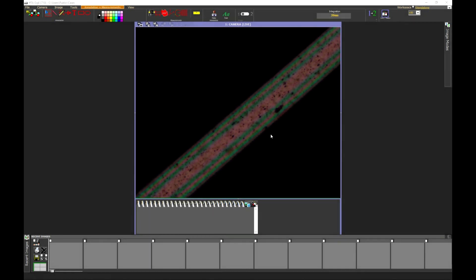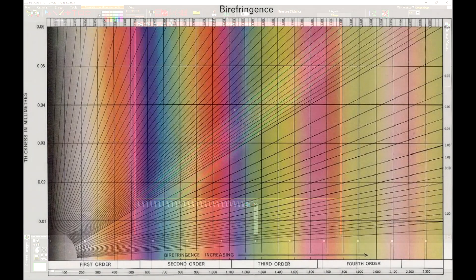We can now begin to identify the type of fibre by analysing the colour of the central core. In this particular example we have a third-order red. After measuring the diameter of the fibre, which is approximately 0.16 millimetres, we can use the polarisation colour chart to determine the type of fibre in this particular sample.